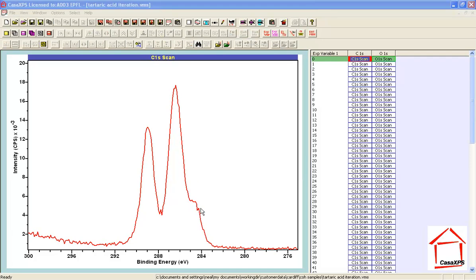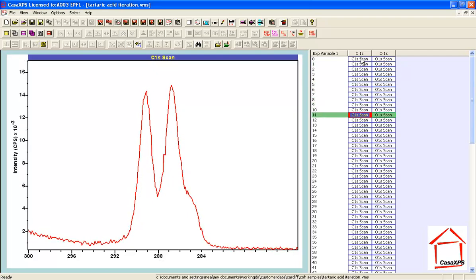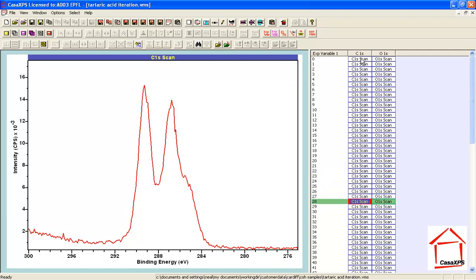While a low binding energy peak, such as the one we see here, could be explained by CH-type chemistry from adventitious carbon, there is also the possibility that the sample itself is susceptible to changes under the influence of X-rays. And so a measurement has been performed here where the same 2 spectra, carbon 1s and oxygen 1s, are repeatedly measured, and we can then trace through this sequence to see if there are any changes that are occurring to the data as a consequence of simply measuring by XPS.